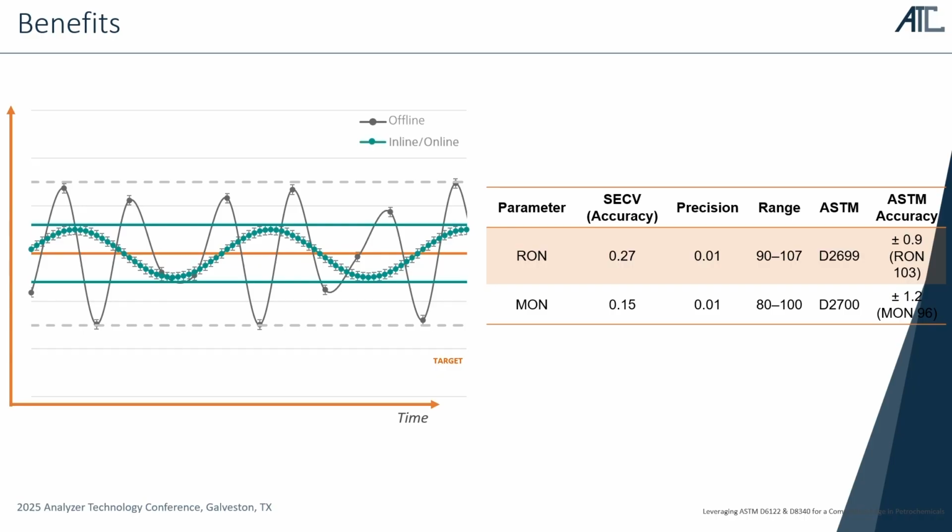And with that, I am through a lot of various topics, and it's probably now like, how do I apply that to the things that I am actually doing? It is difficult since spectroscopy can do so much. As long as there is a reference technology in place, there is a way to move that to spectroscopy as well. There are a few limitations, but a lot of things can be done with process spectroscopy. And I would be happy to take some questions or have you stop by the booth later and talk about your specific situation. You have to raise your hand if you have a question.